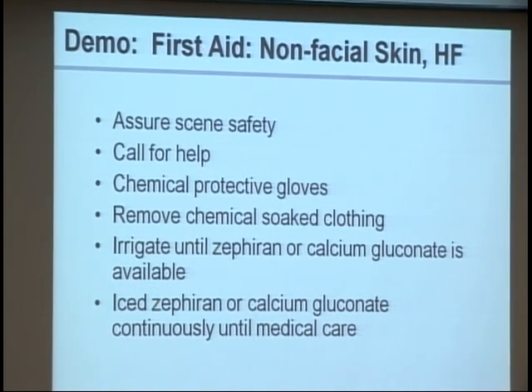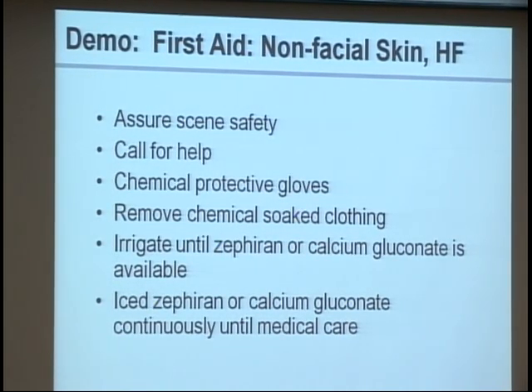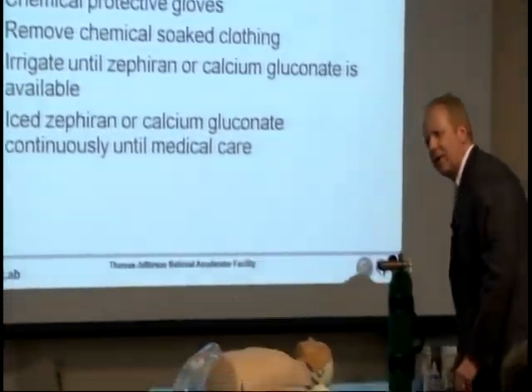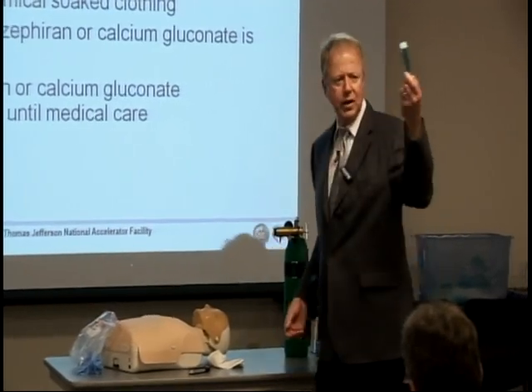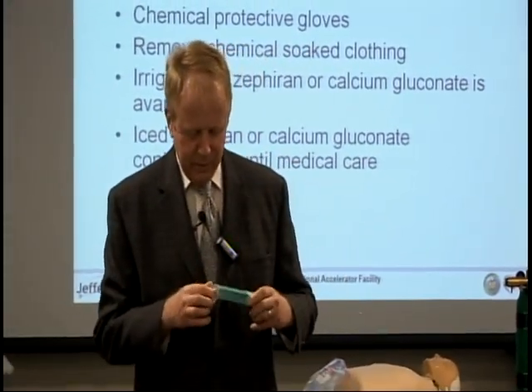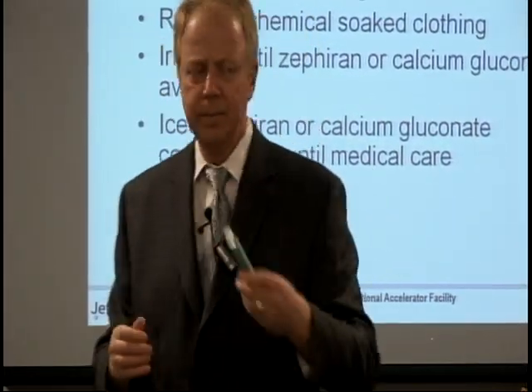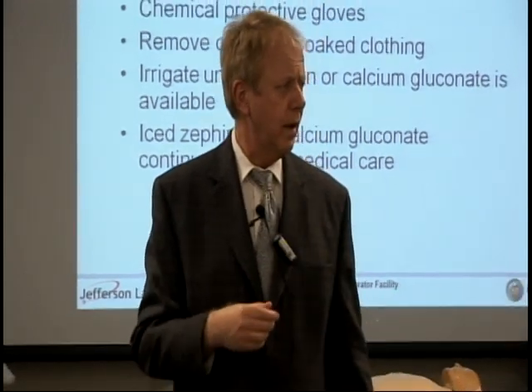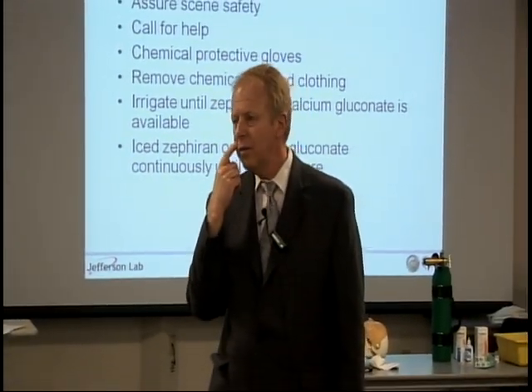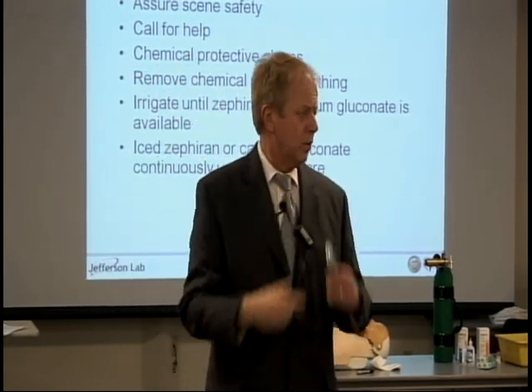Okay, so do y'all want to demo this? It's basically a cream. Alright, here's your calcium gluconate — this is what y'all's looks like. So you open it. It's a tube and you put it on the affected area, just squirt it out, and then with a gloved hand you just gently rub.